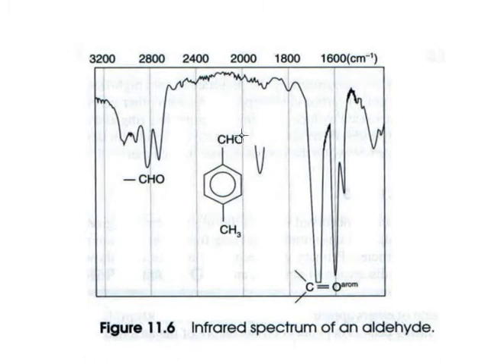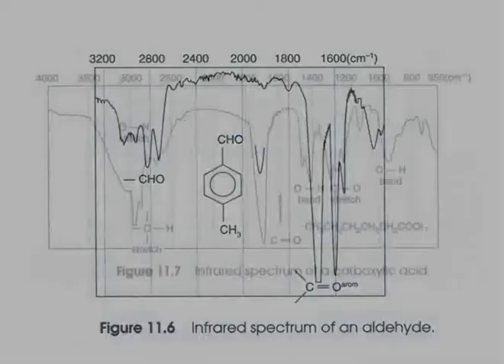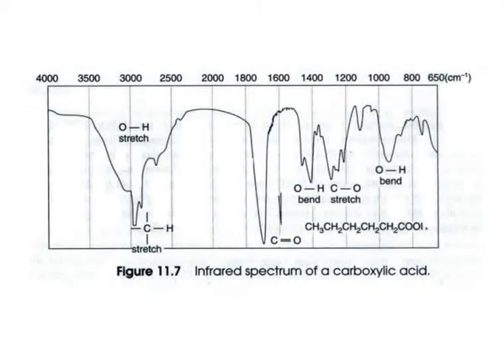Now of course there's a carbonyl group. We should see a big peak for it, and indeed here it is right here. This big peak is associated with the C double bond O stretching motion. The next spectrum is of a carboxylic acid. There's a little glitch in the structural formula. This is an abbreviation for the carboxyl group, there's a C double bond O OH. The symbol H is partly cut off here.